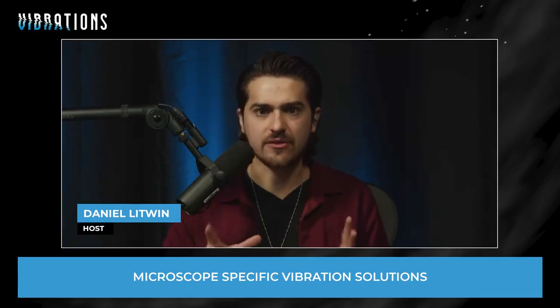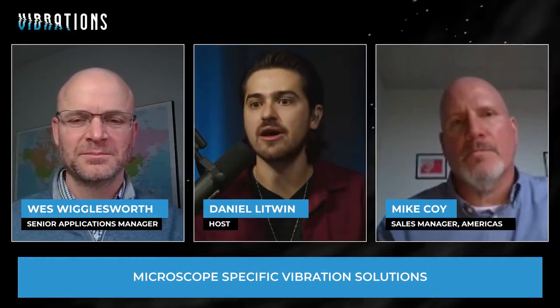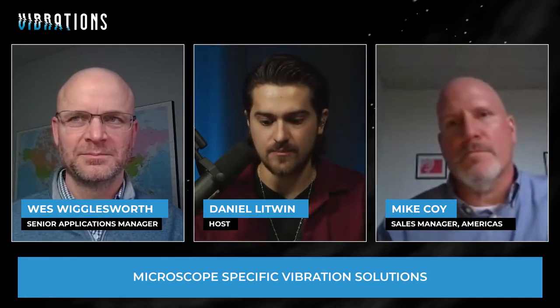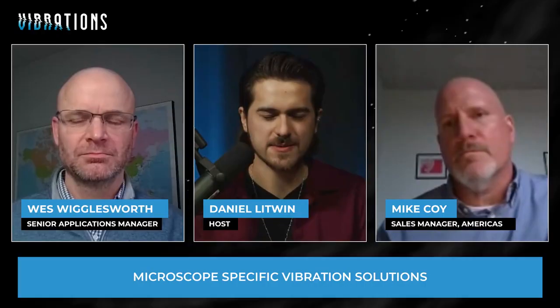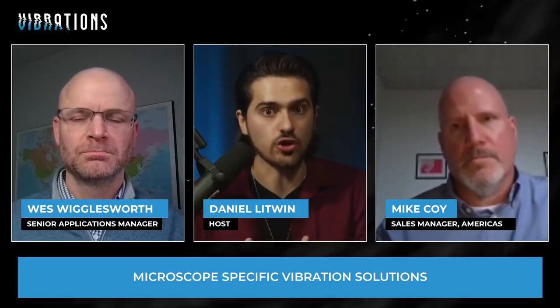When selecting a microscope, obviously it's essential to account for the environment's vibration levels. Right? What is going to be causing vibration in this environment? Is it other machinery? Is it construction nearby? Are you in a windy area? Are you on a higher floor where there might be some building movement? Right. And so this obviously will determine some of the instrument's vibration requirements, and we can measure some of this through vibration criteria, VC curves.